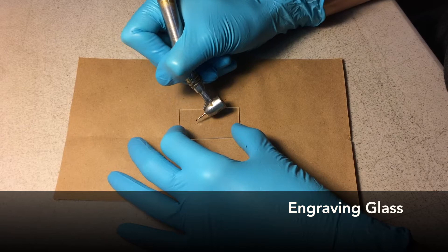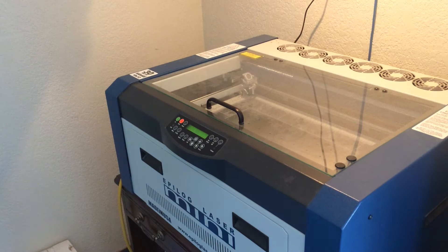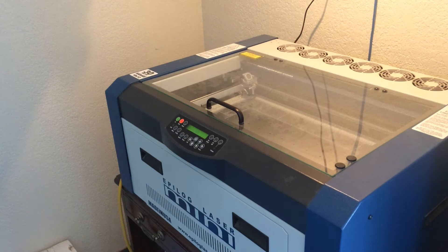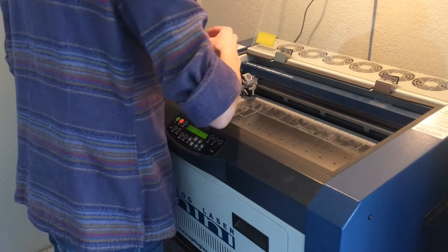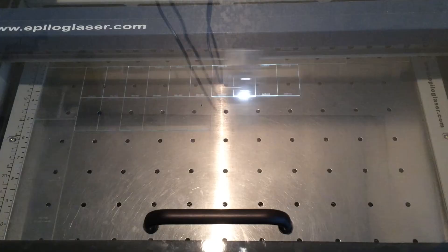We used to hand engrave sample identifiers on every slide using a dental tool, and we still use this method for transferring orientation and direction markings to the glass. However, using a laser engraver for printing sample IDs has streamlined the process and improved legibility. A file is sent from our database, blank slides are lined up, and a moment later the entire order is engraved and ready to mount.